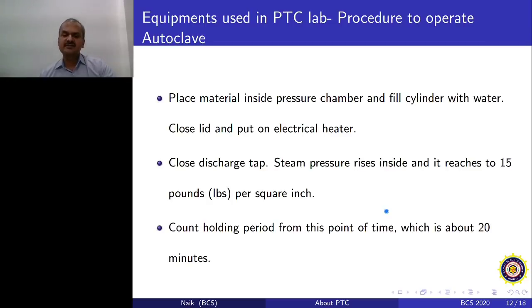After reaching that pressure you should count the holding period, meaning you start counting the time, and once the timer shows 20 minutes, that is the autoclaving time.